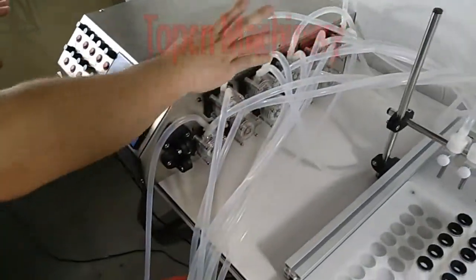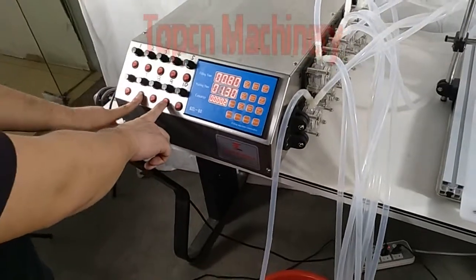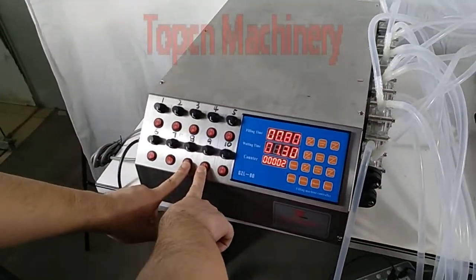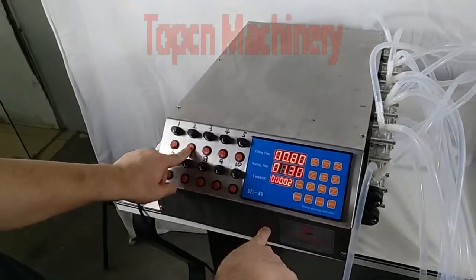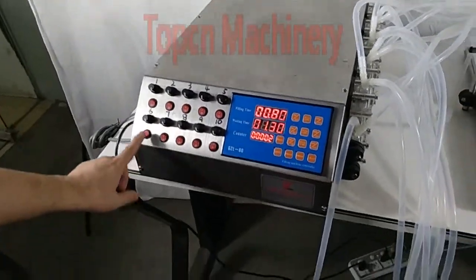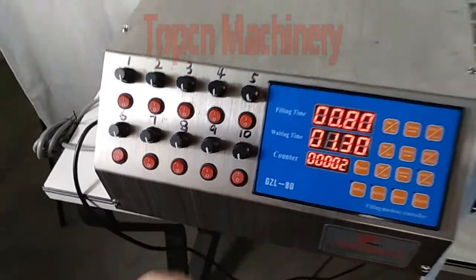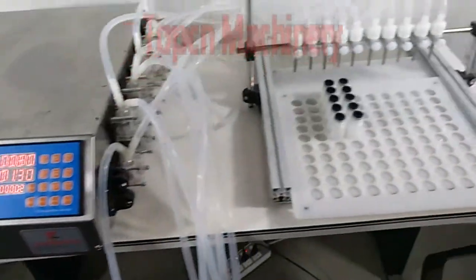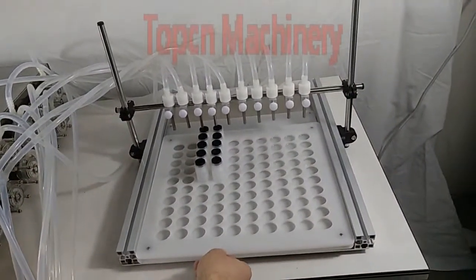I just turned on number 10 and number 6, then turned the rest off. As you can see, only number 6 and number 10 are open.